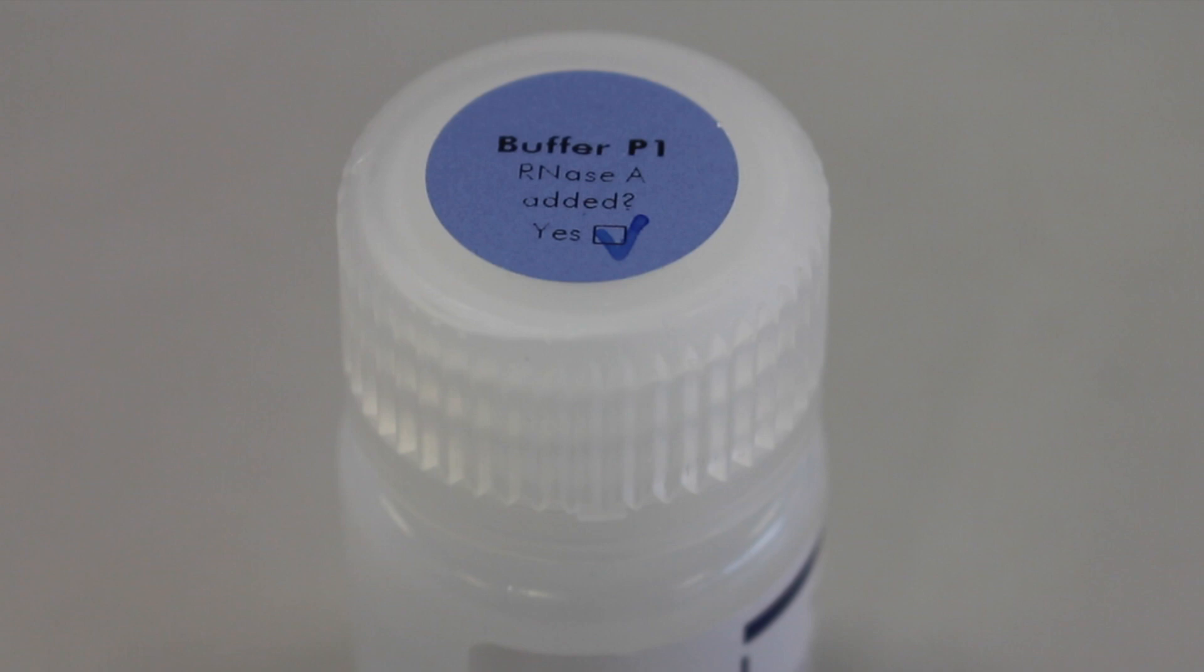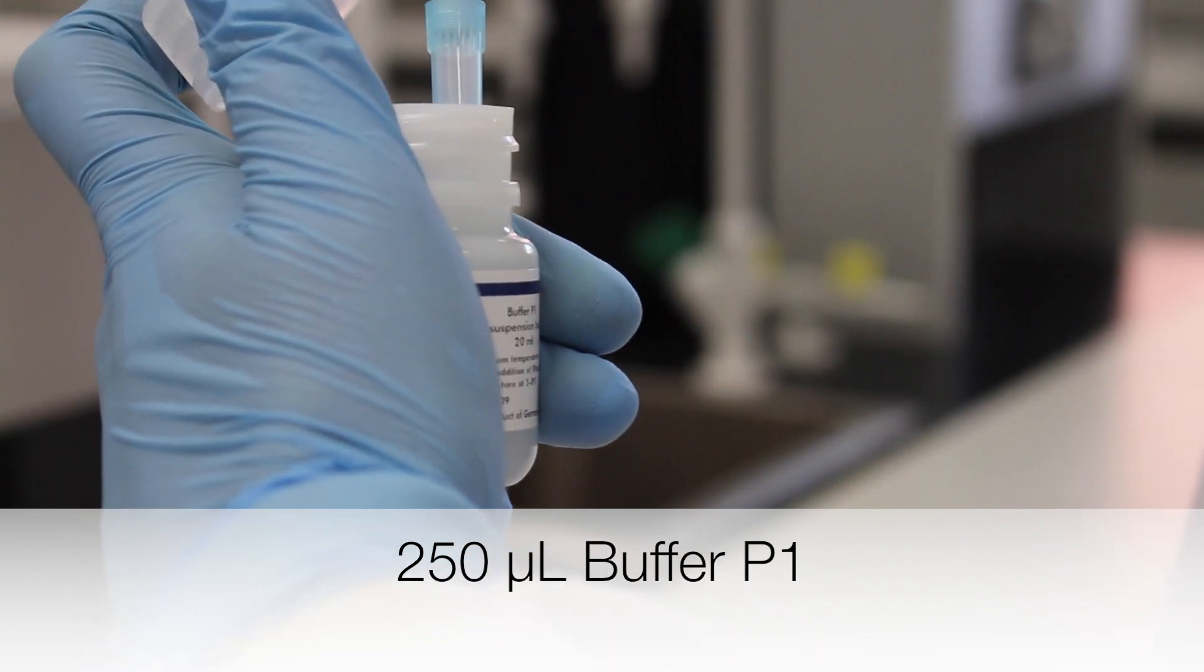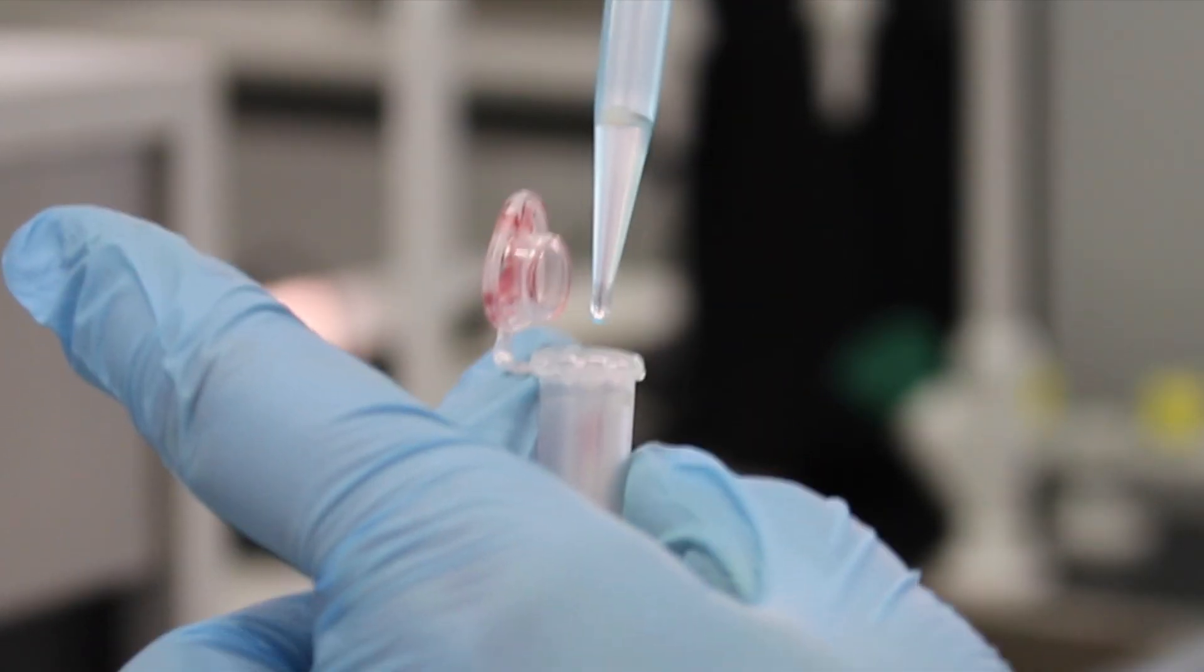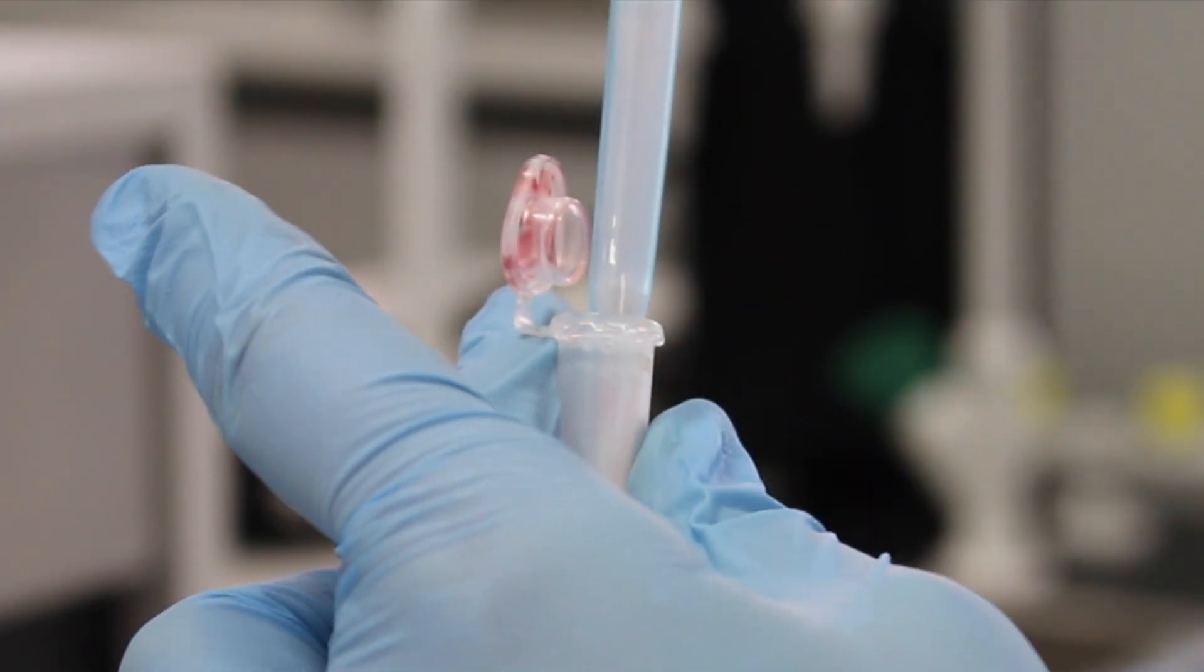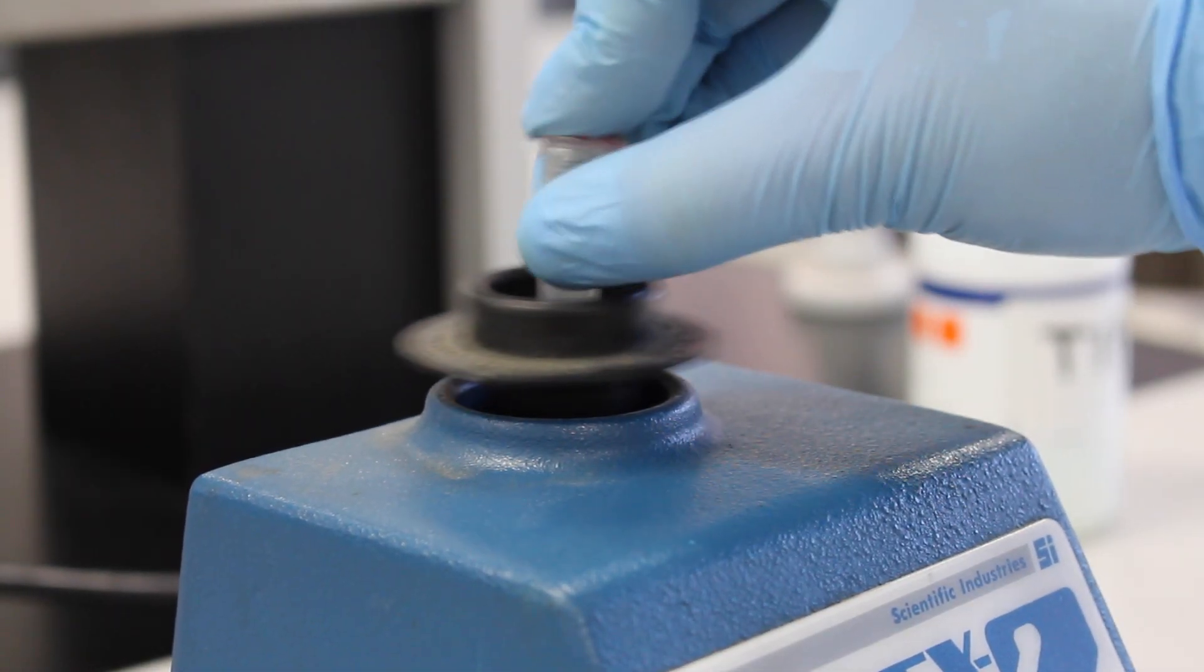This will prevent the cells from being associated with the waste. 250 microliters of buffer P1 is added to each tube. This buffer destabilizes the cell membrane and macromolecules. This will allow the DNA to be separated from other cell components. The tubes are vortexed to make sure that the entire pellet has been resuspended.